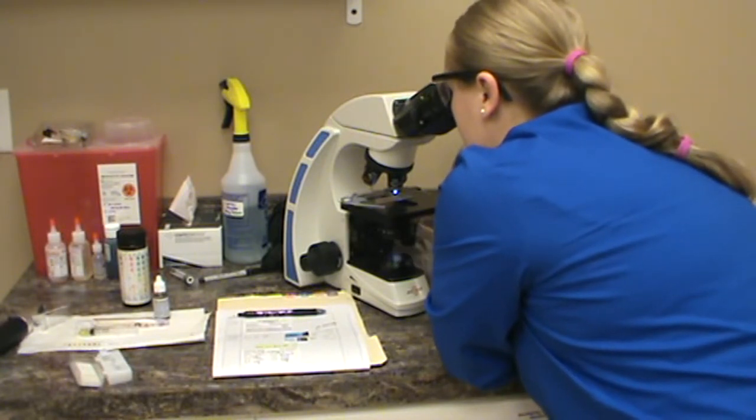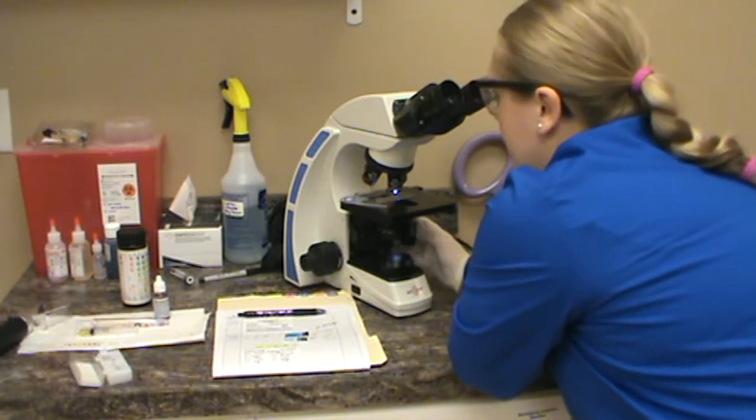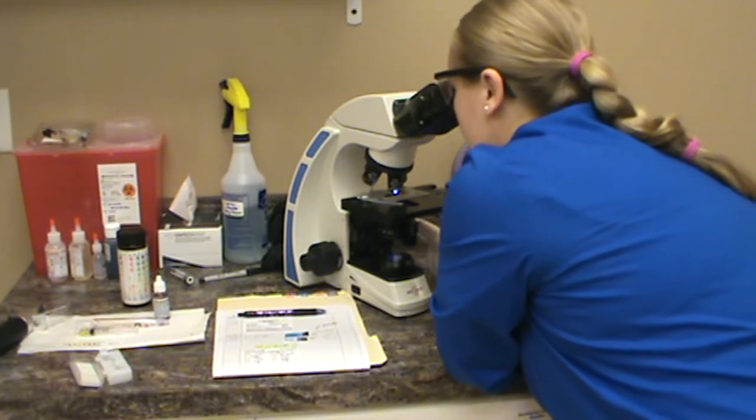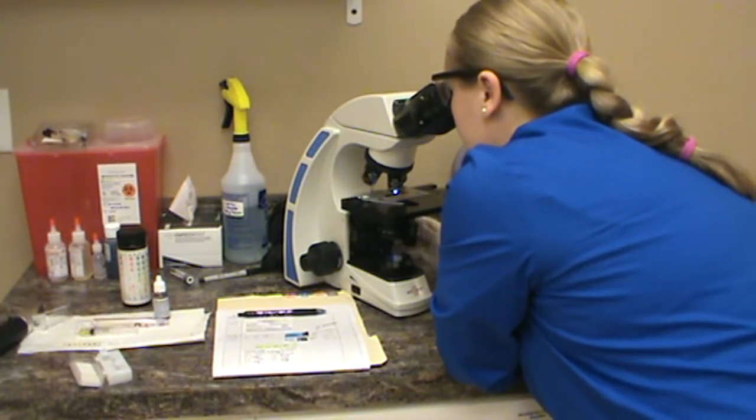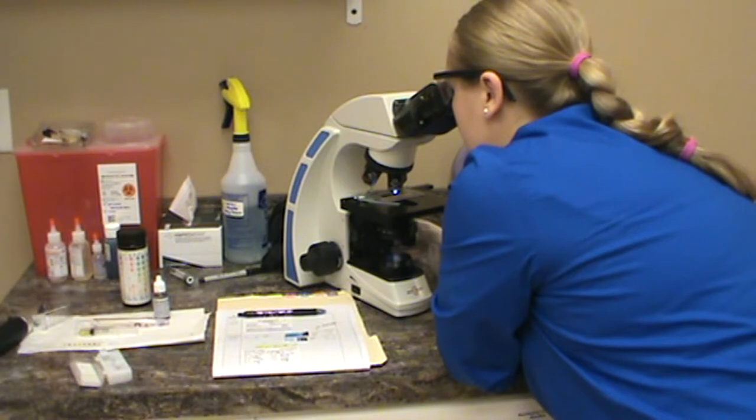My stained side is looking pretty good — a little bit of amorphous debris, probably from our free catch. I'm going to go over to the unstained slide and look for anything over there. This is looking pretty clean. This is just a senior screen UA — she's not expected to have a UTI. So this one's looking good too.